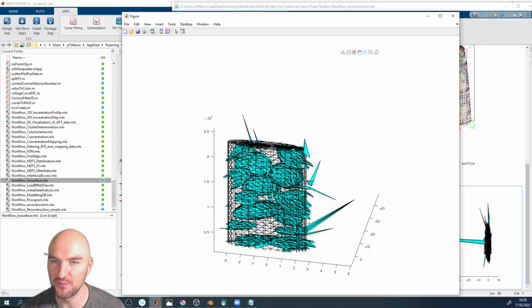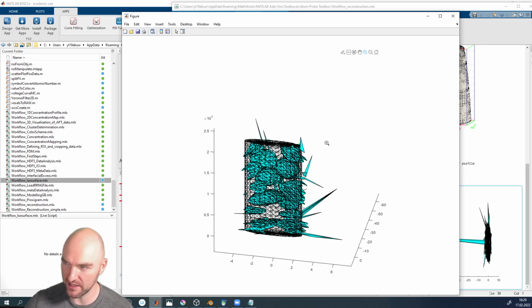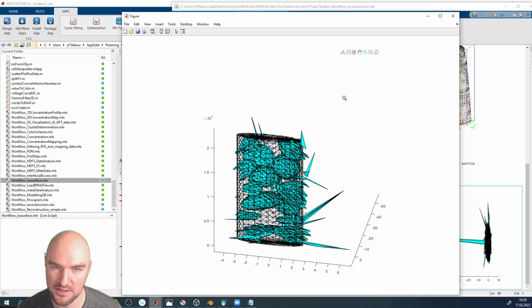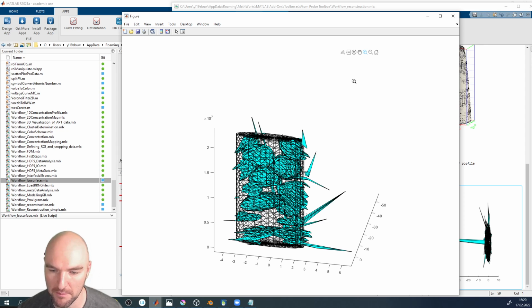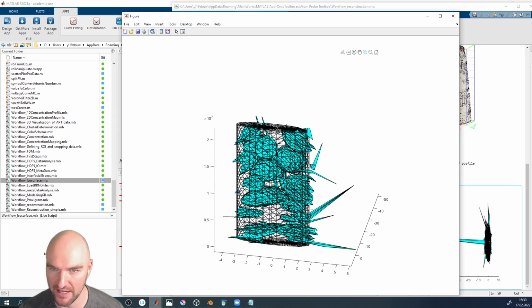One problem we've encountered now with the isosurfaces is that since we're using a certain sample size of atoms in order to do our inverse reconstruction, some of the vertices might lie outside of the domain of our data set. And those vertices are then outside of any of the tetrahedra, which means they don't have a meaningful barycentric coordinate. For anything that we actually want to do with the data, that doesn't matter all that much, because they're not inside the data domain anyway.